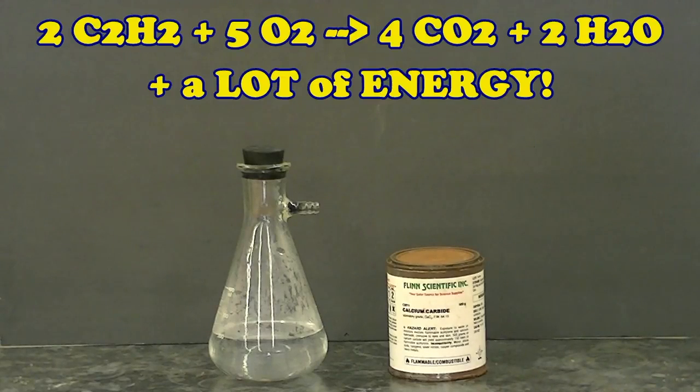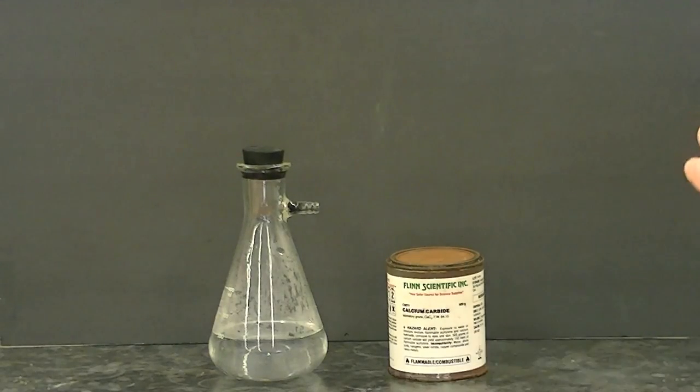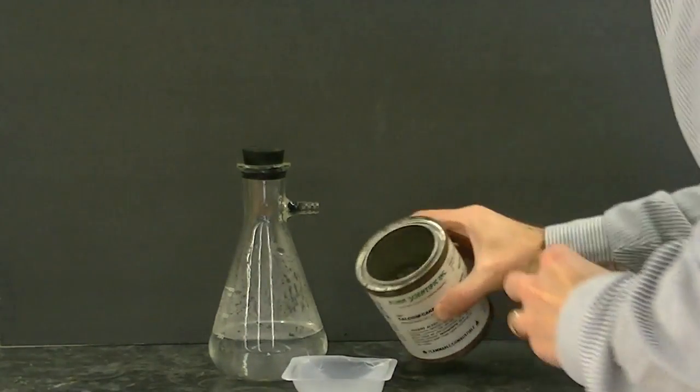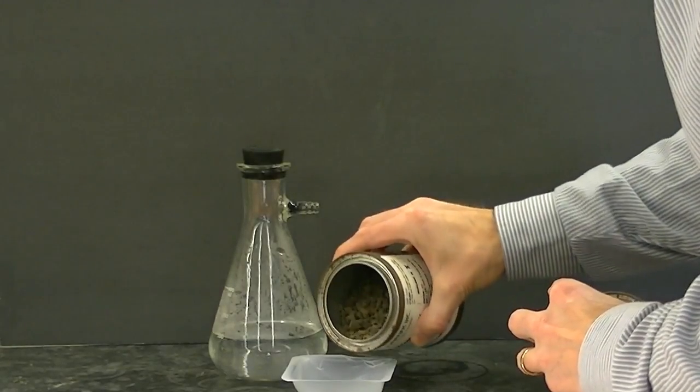Now, acetylene gas is quite explosive. It reacts vigorously with oxygen to form carbon dioxide, water, and a lot of energy. We'll use this setup here to show you that. I'll take some calcium carbide and place it into this container here.